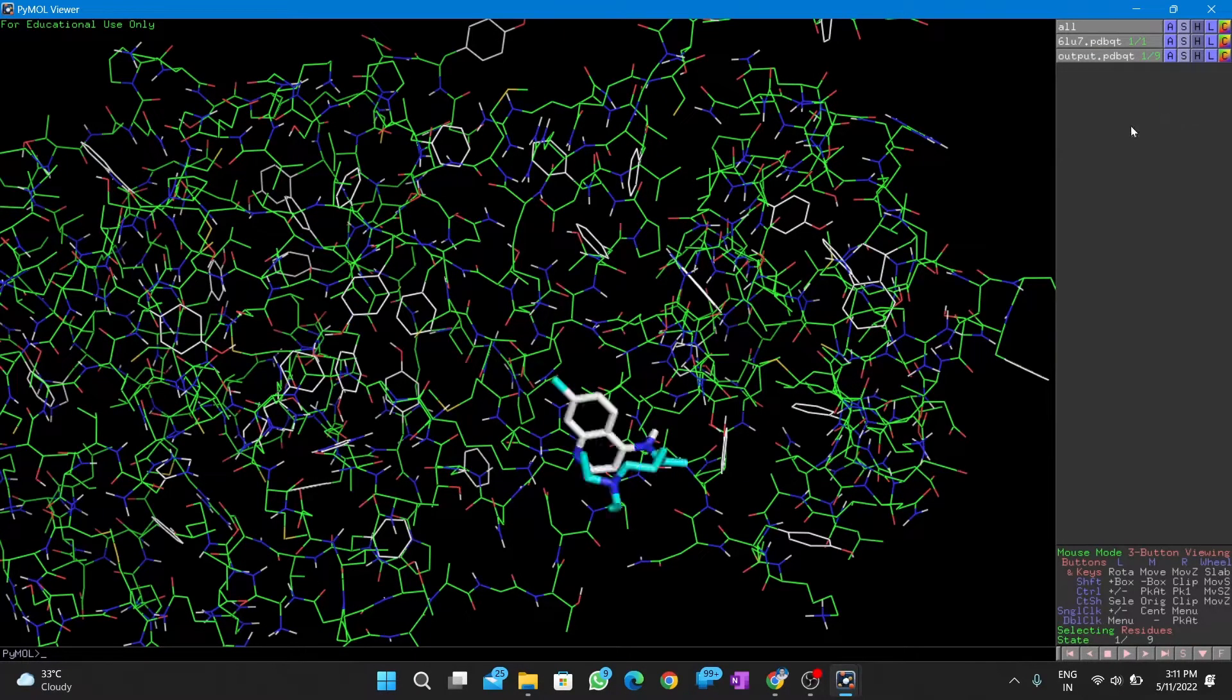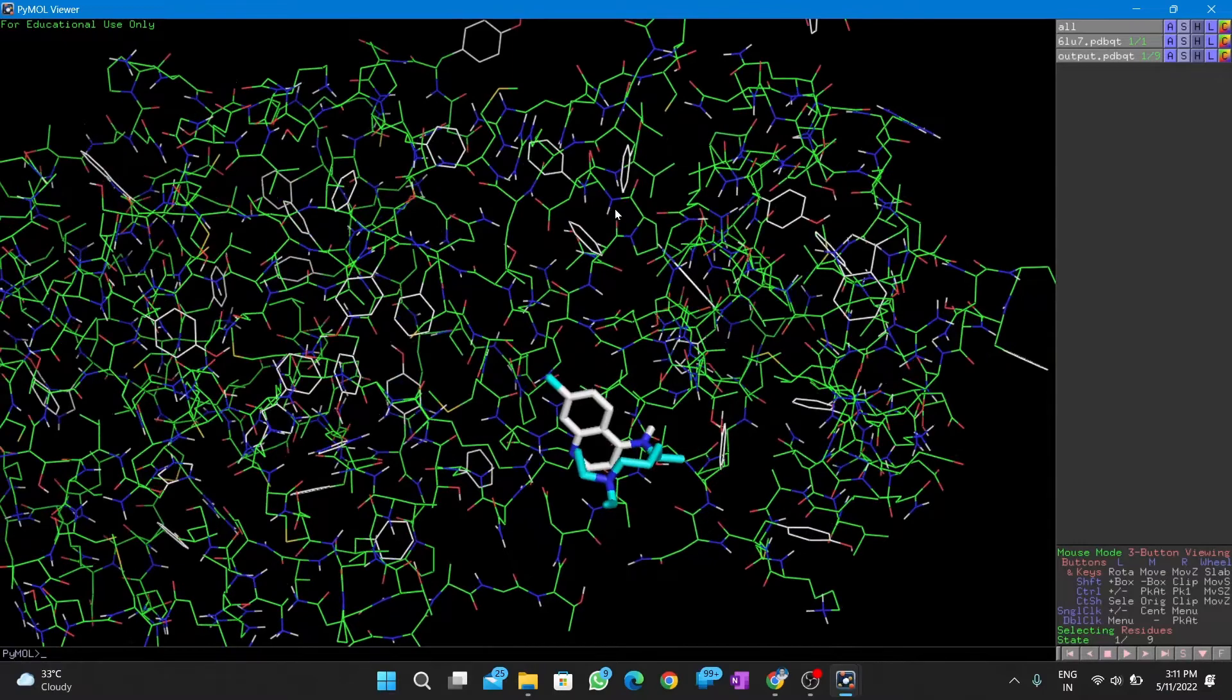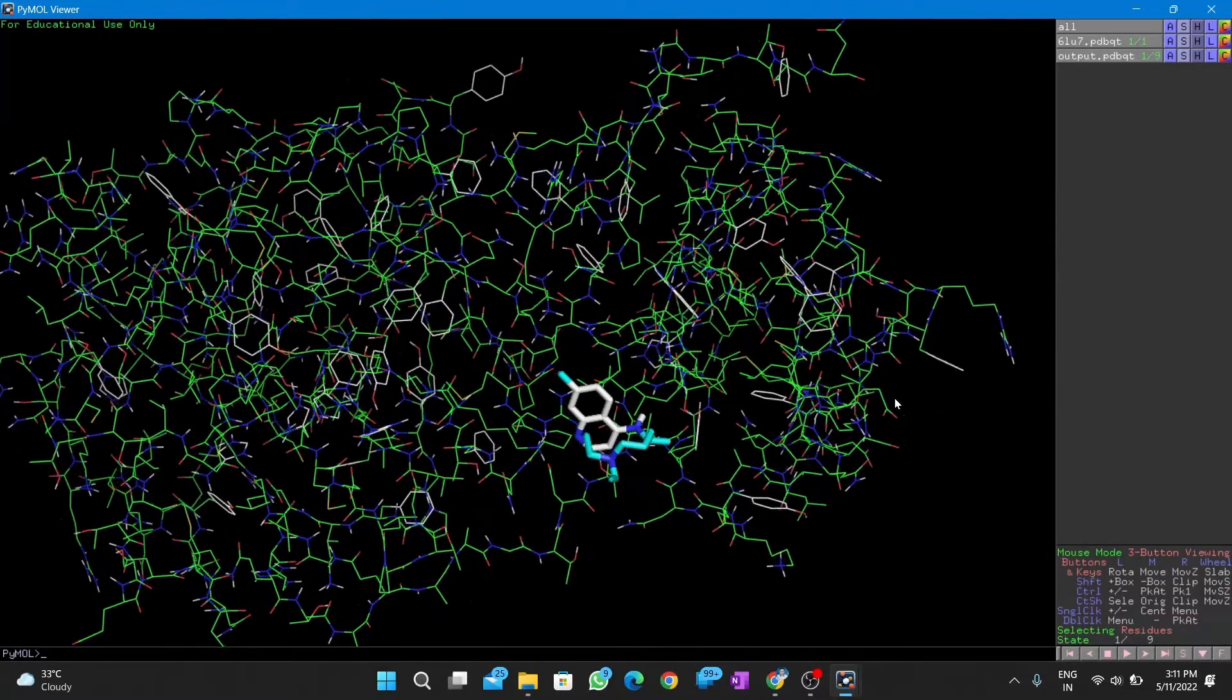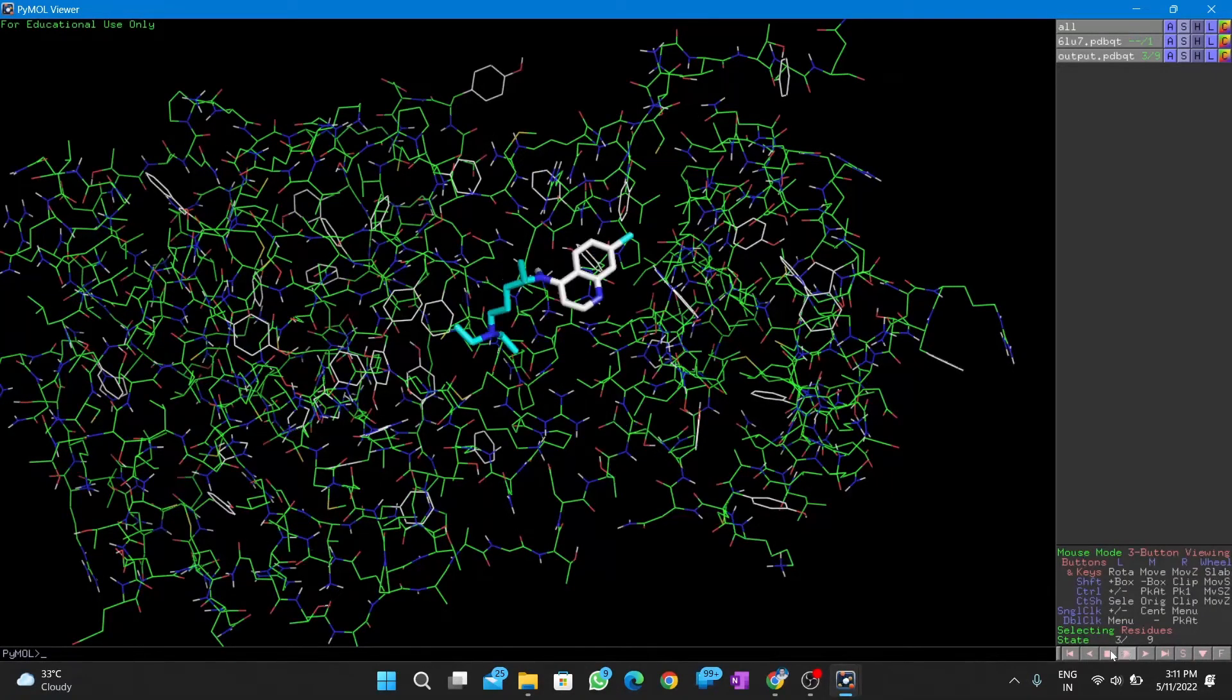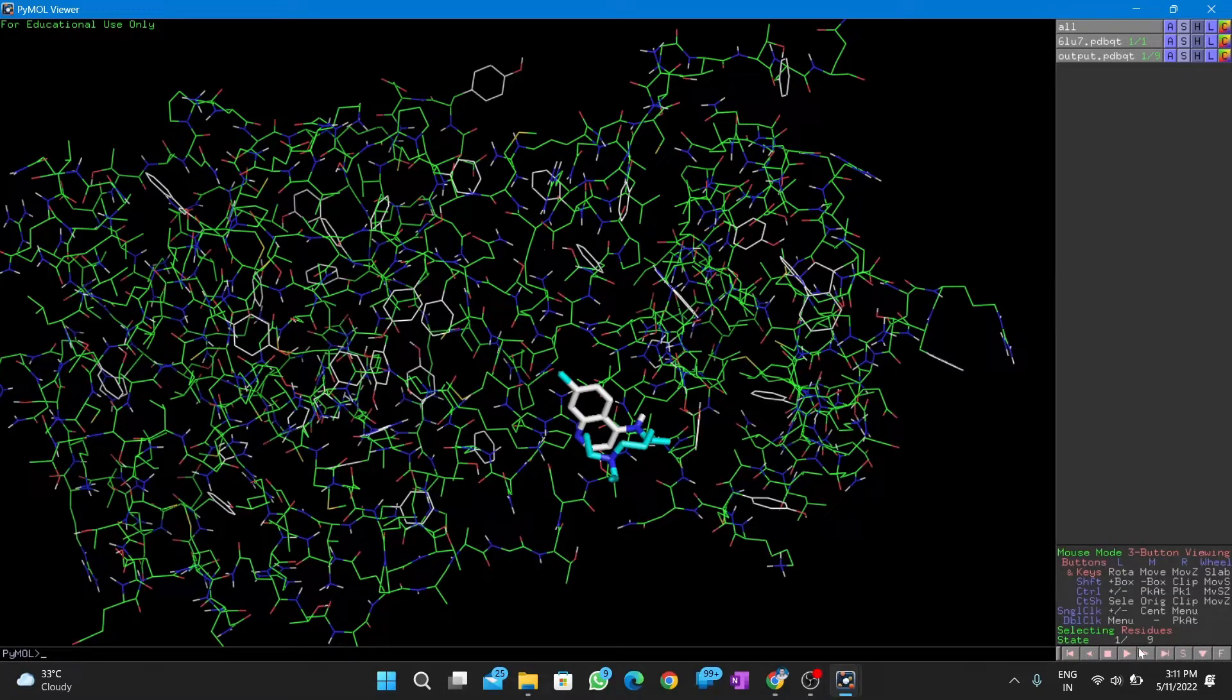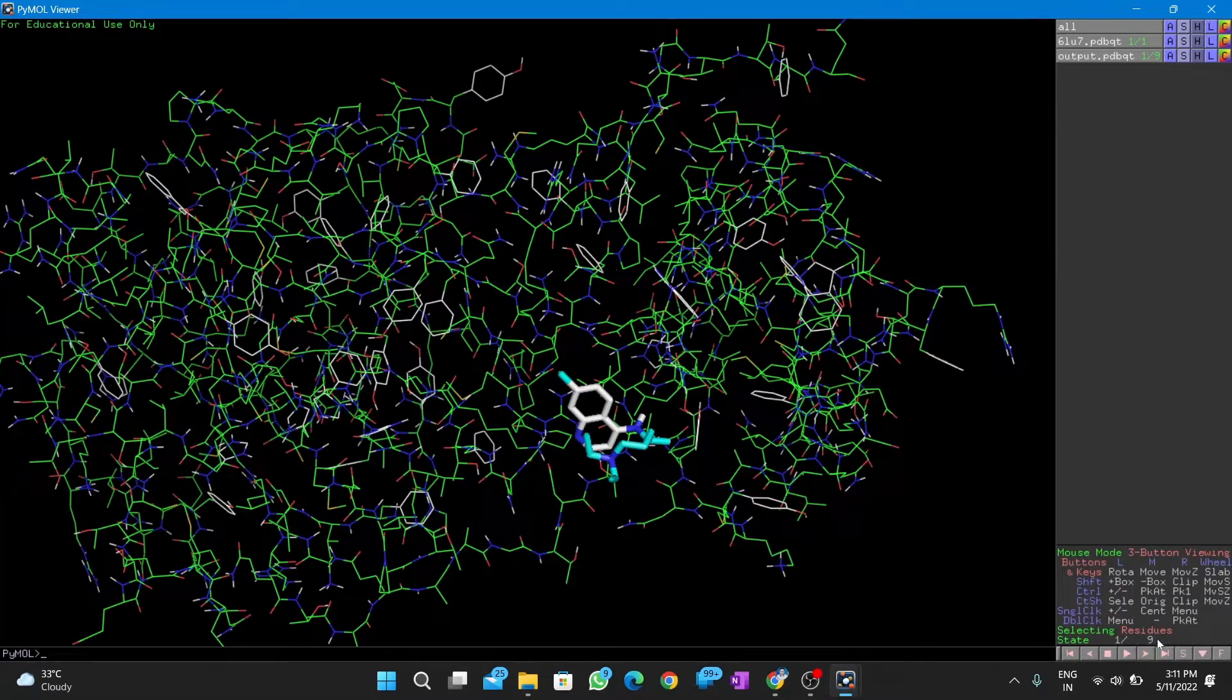We change the ligand to the stick model which is easy to differentiate. At the bottom right, you can see arrows to play the different conformations or to toggle between every conformation. The best conformation with the least binding energy is the first one.